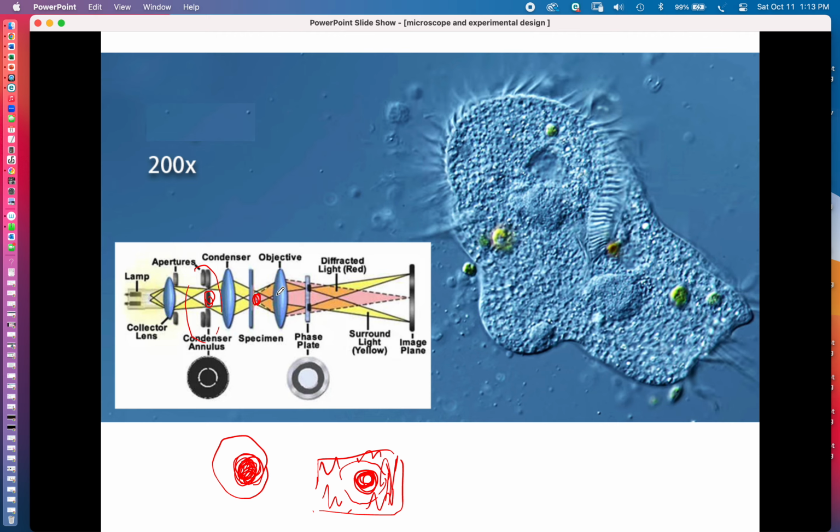And what we're doing is we're just making it more difficult for the light to make it up to your eye. And so similar to the dark field, we see some light differently because of its ability to get up to our eye. And what's happening here in part is that if the light gets refracted just a little bit, it won't make it up to our eye.